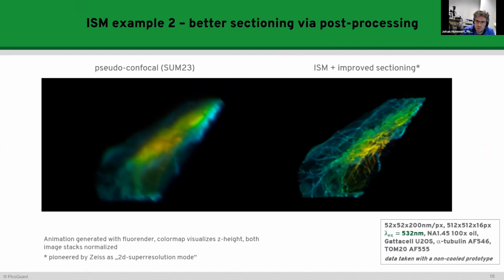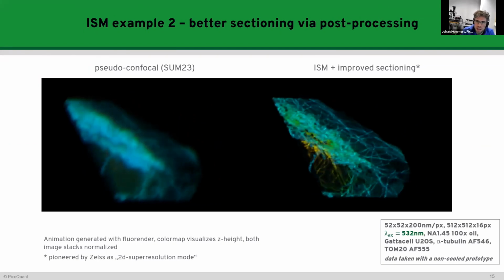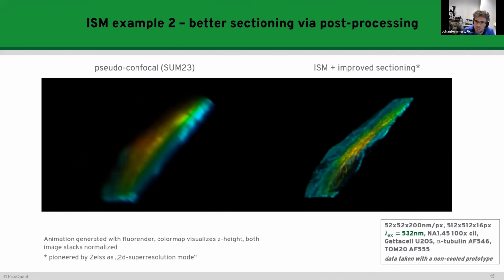This gives not only better lateral resolution, but also improved sectioning, and that you can appreciate very well in this video, where the color scale now encodes the Z information, so the height in the sample.